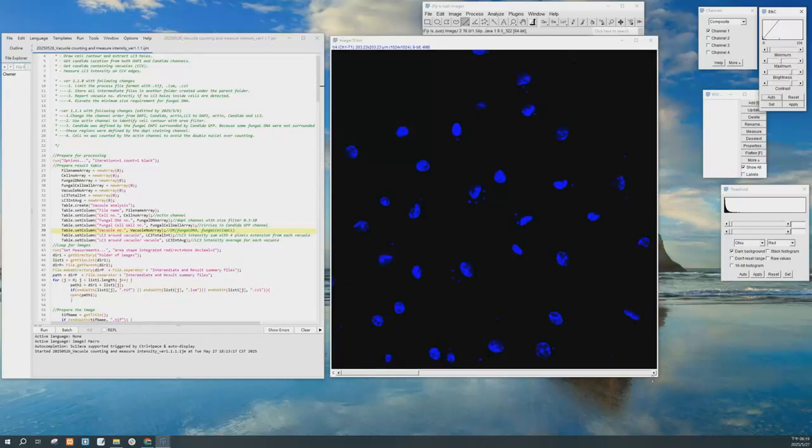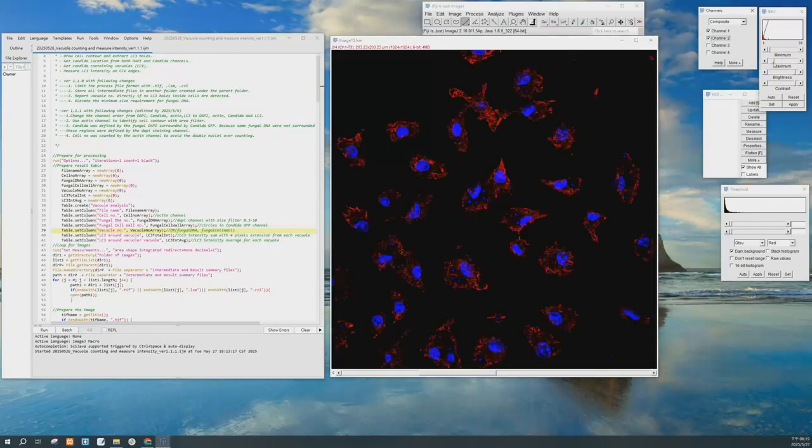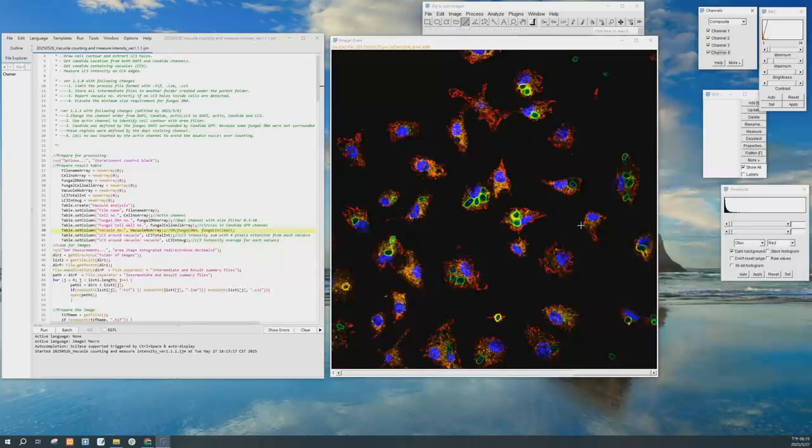The second channel is actin. The actin channel helps locate and count cells. The third channel is Candida's cell wall staining. You can see it forms these ring-like structures. During quantification, these ring structures in the GFP channel are counted too. The fourth channel represents LC3, an autophagosomal marker. This is what we ultimately want to measure, the LC3 intensity around the vacuole.